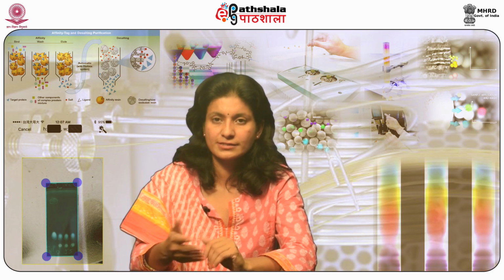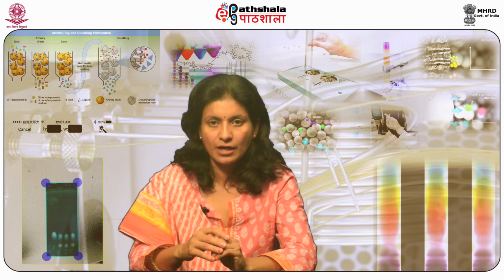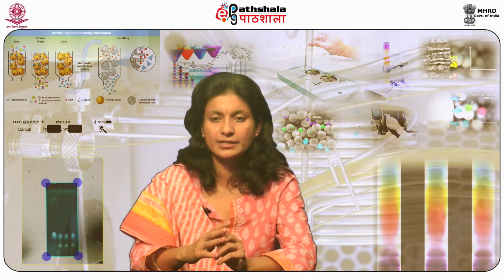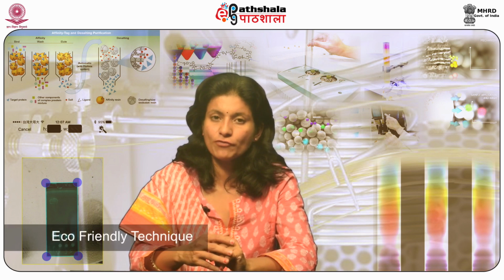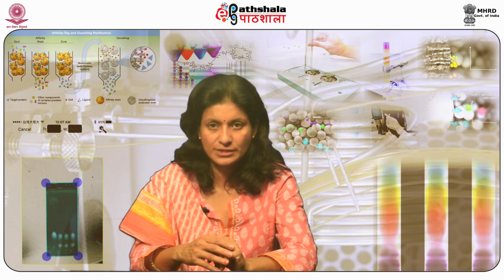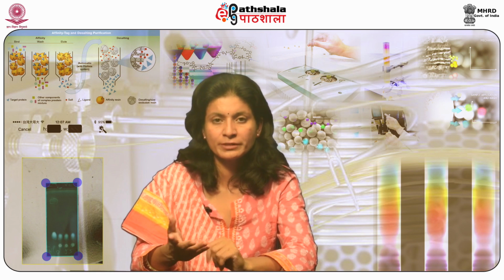It is a non-denaturing process. It can be maintained by altering the salt concentration, pH, and the ion exchange media. It provides high selectivity and can resolve molecules with little variations in charge. It can serve as an intensifying step. A huge volume of diluted sample can be applied to a media and the adsorbed proteins afterwards eluted in a petite volume. It is an eco-friendly technique as it deals with substances existing in water, with longer life of resin and economical maintenance.